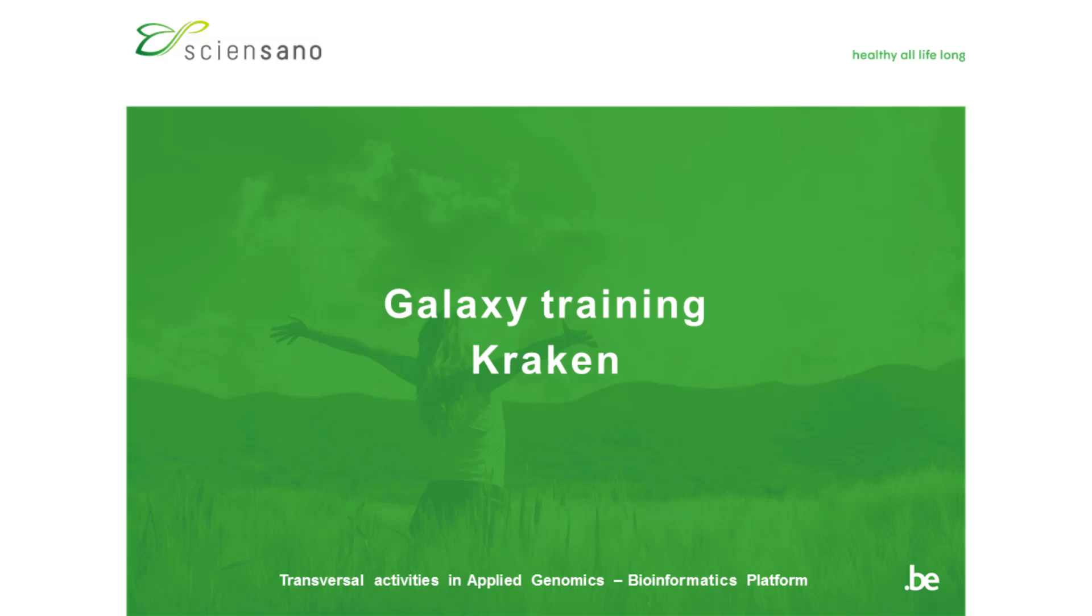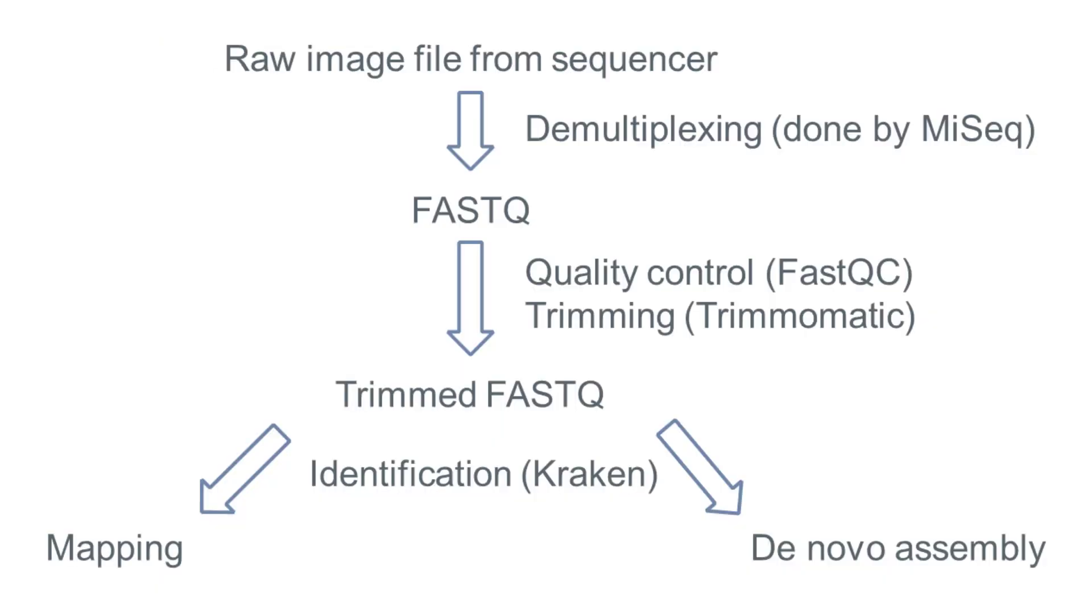In the previous videos we saw how we can perform quality control on the reads and only retain the high quality reads. The next step in the workflow is the identification of the species in the sample. There are several reasons why you want to verify the species in your sample.